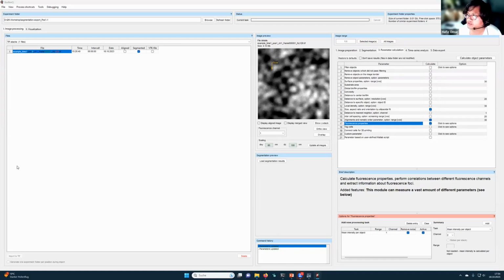And the segmentation should be run with Napari and also StarDist, like you suggested. For the StarDist or the Napari plugin, what I would suggest is you use the plugin to play around. But I don't know how big your data set is. If you have a big data set, I would recommend automating your segmentation, but you can still use StarDist because it's in Python, it's easily scripted. Yeah, we do have a kind of big data set for the pilot.